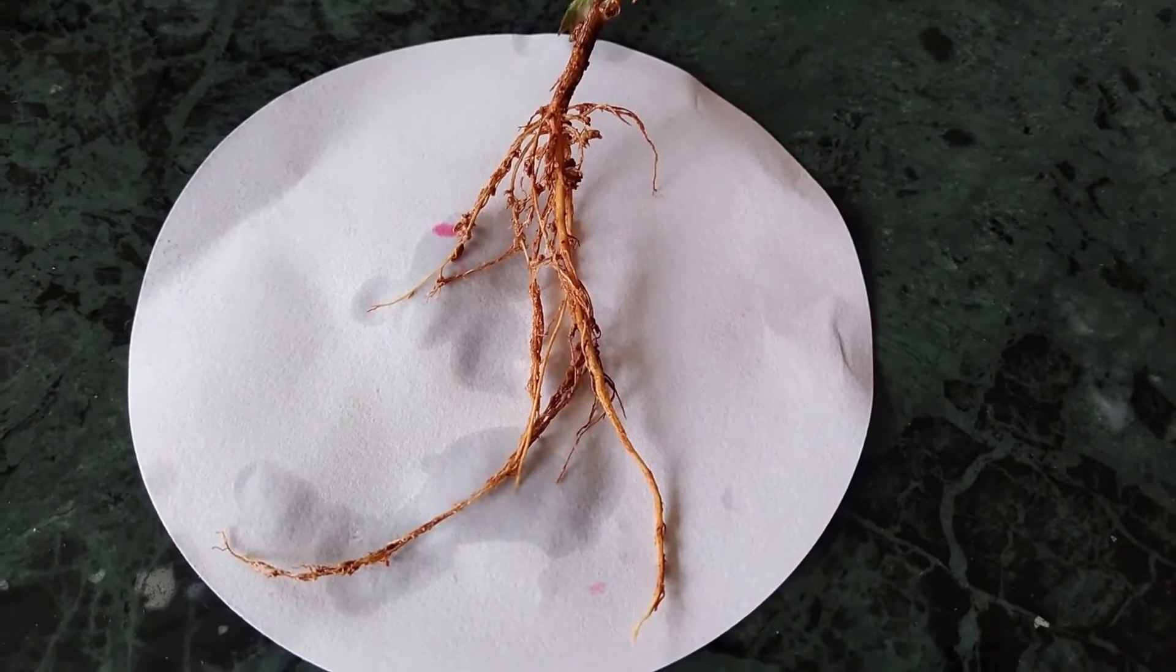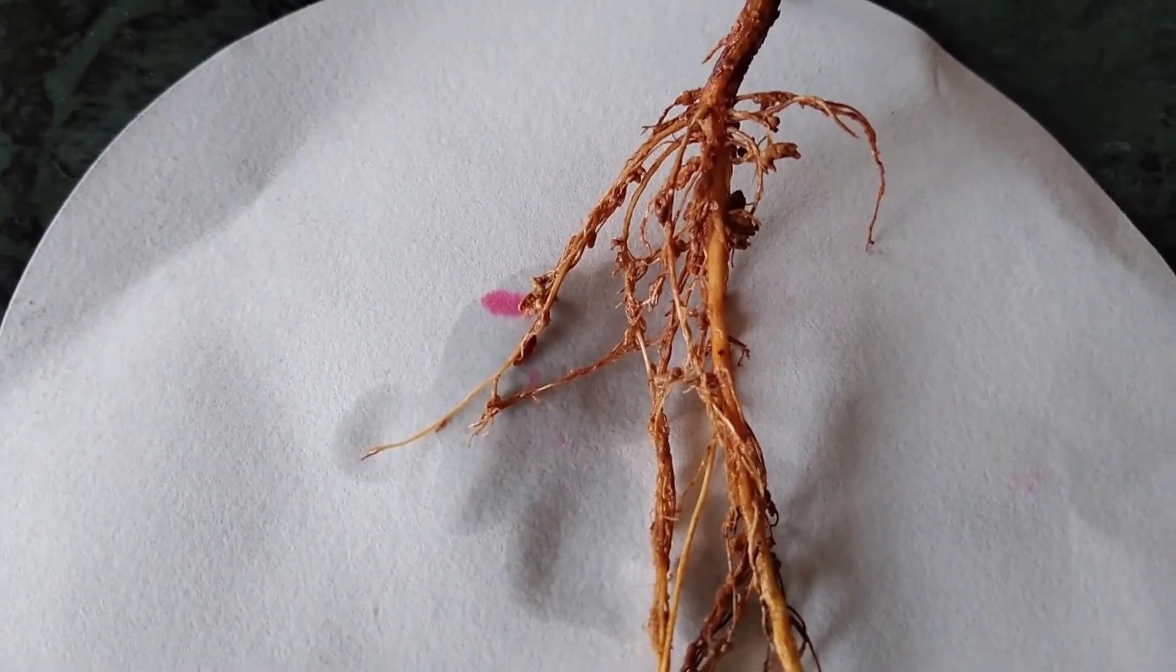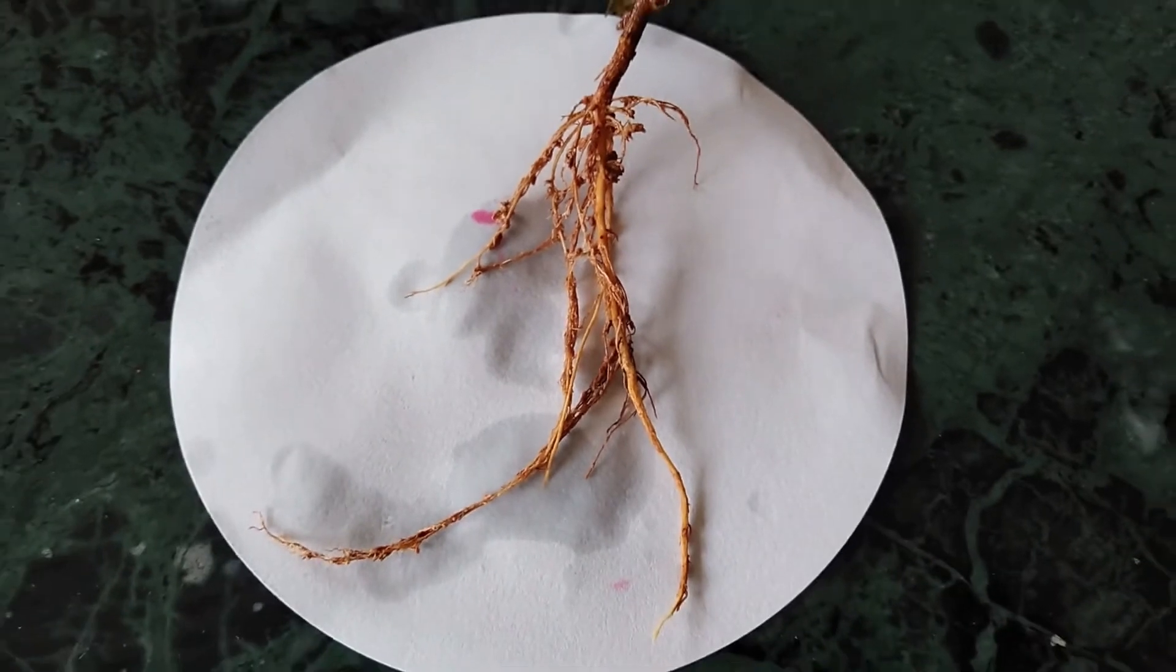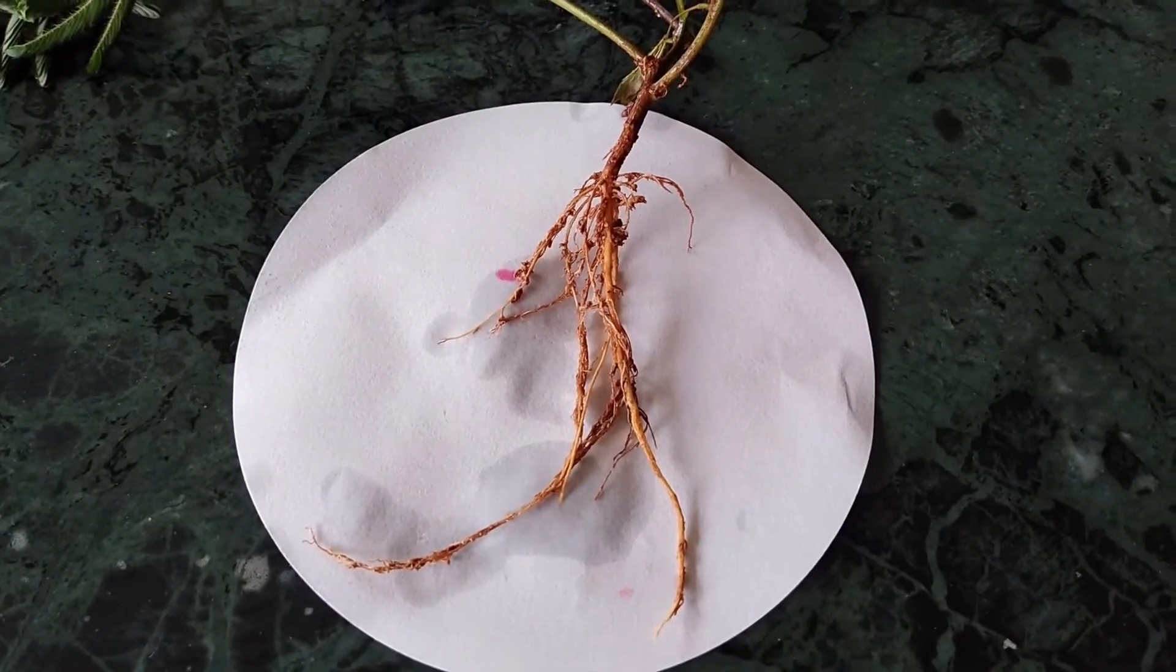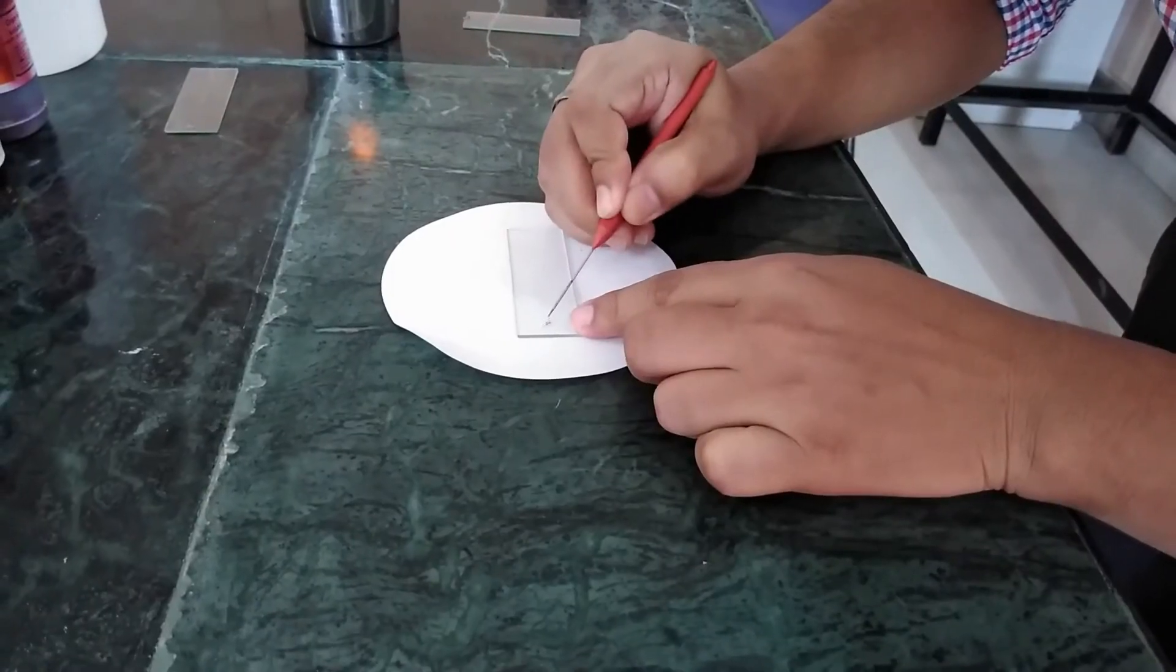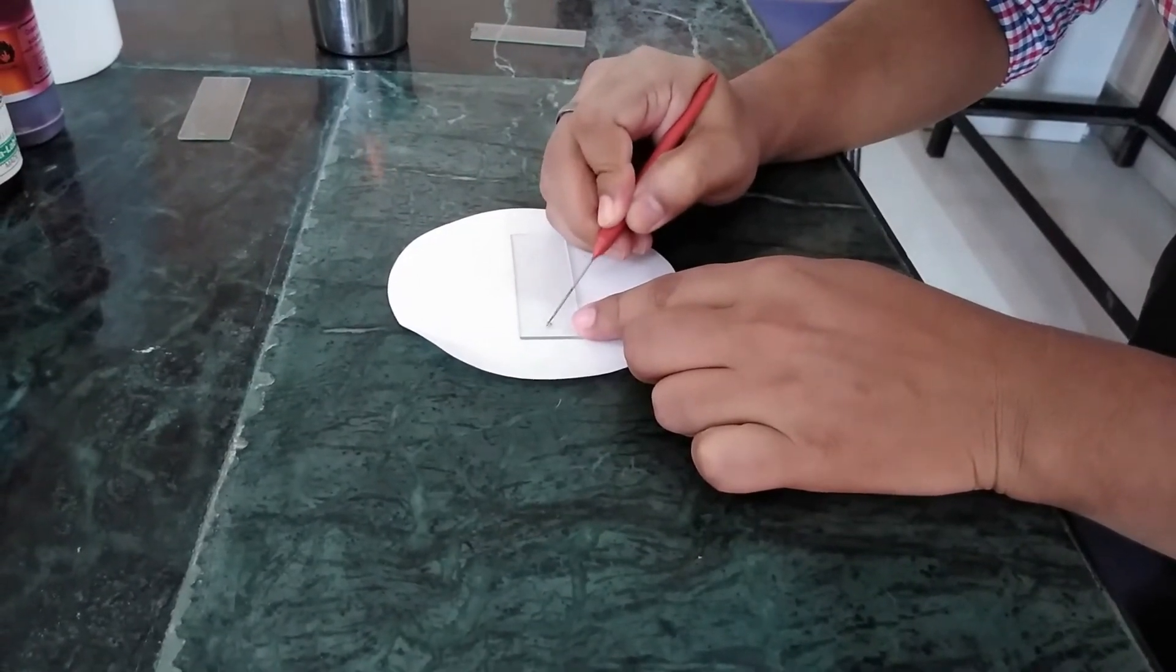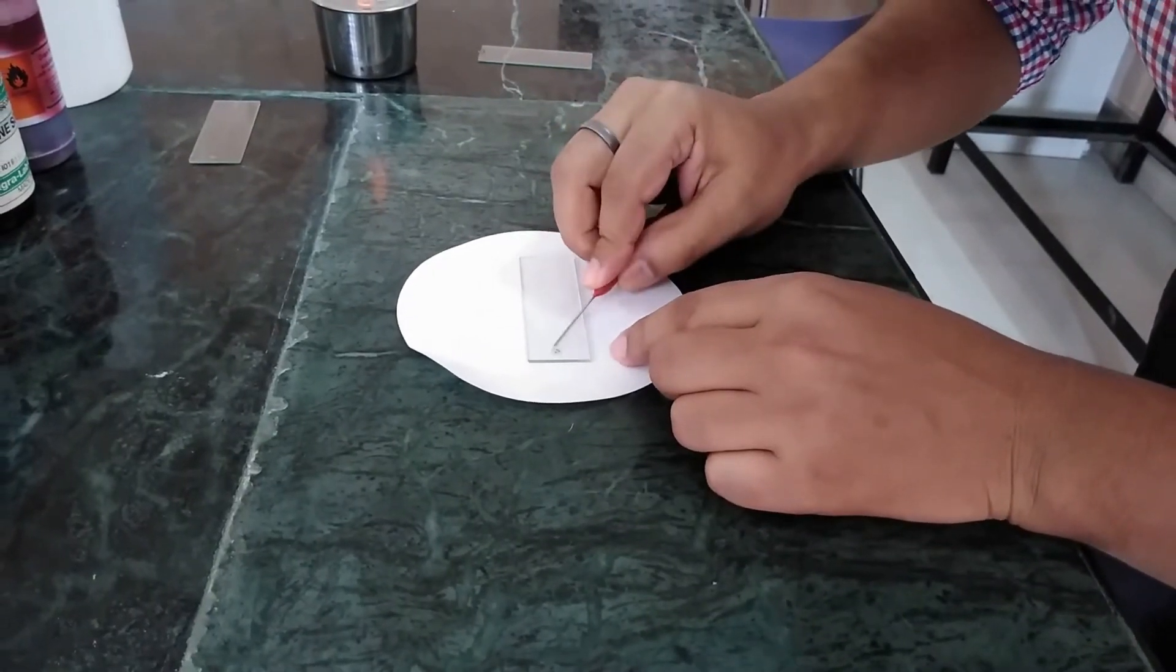Here, root nodules of leguminous crop is used for the study. Then, a small nodule is taken out from the root and placed on the clean glass slide and then crushed properly.